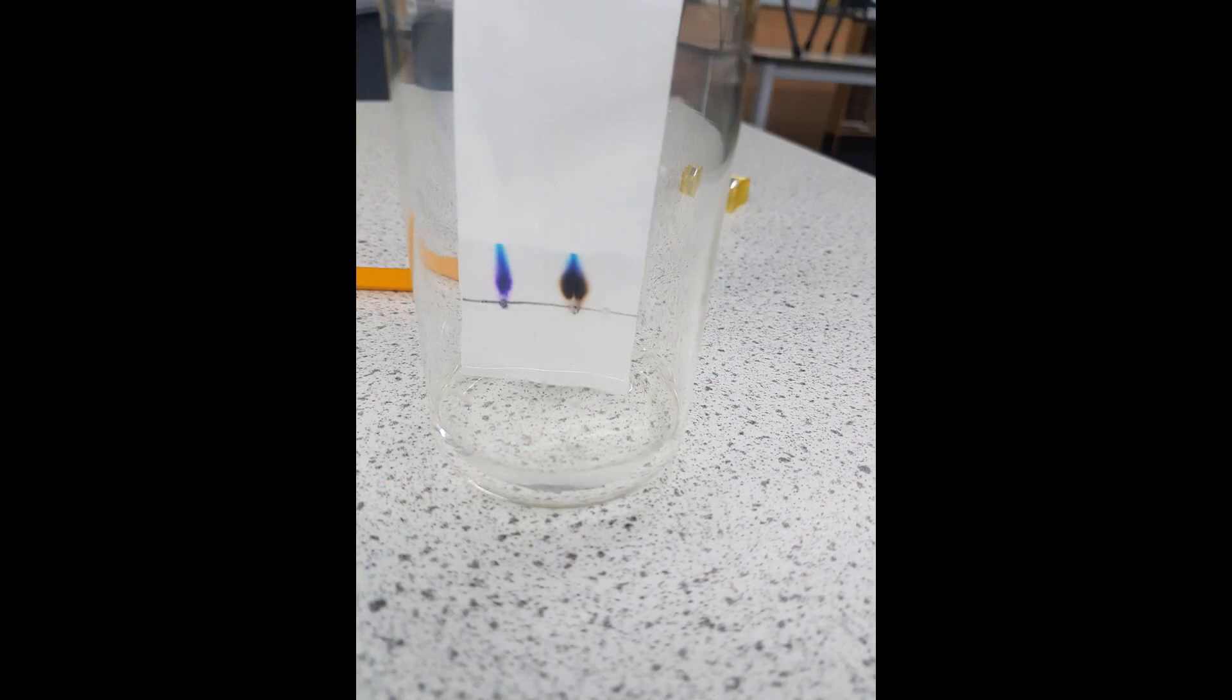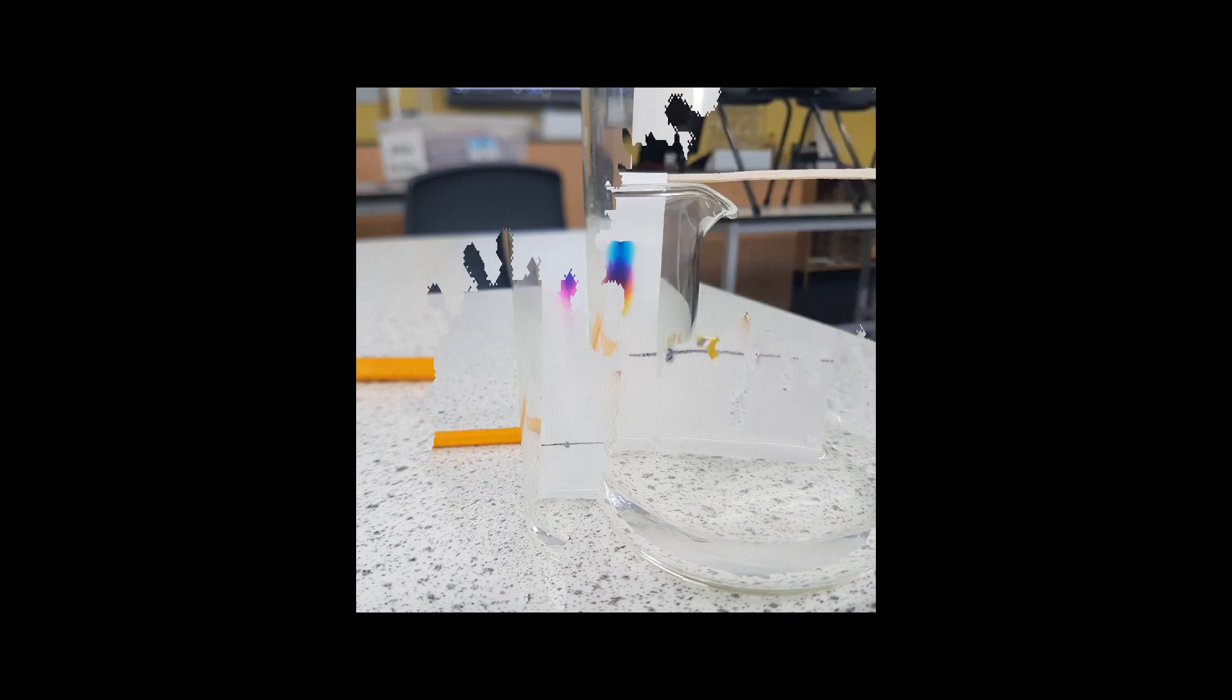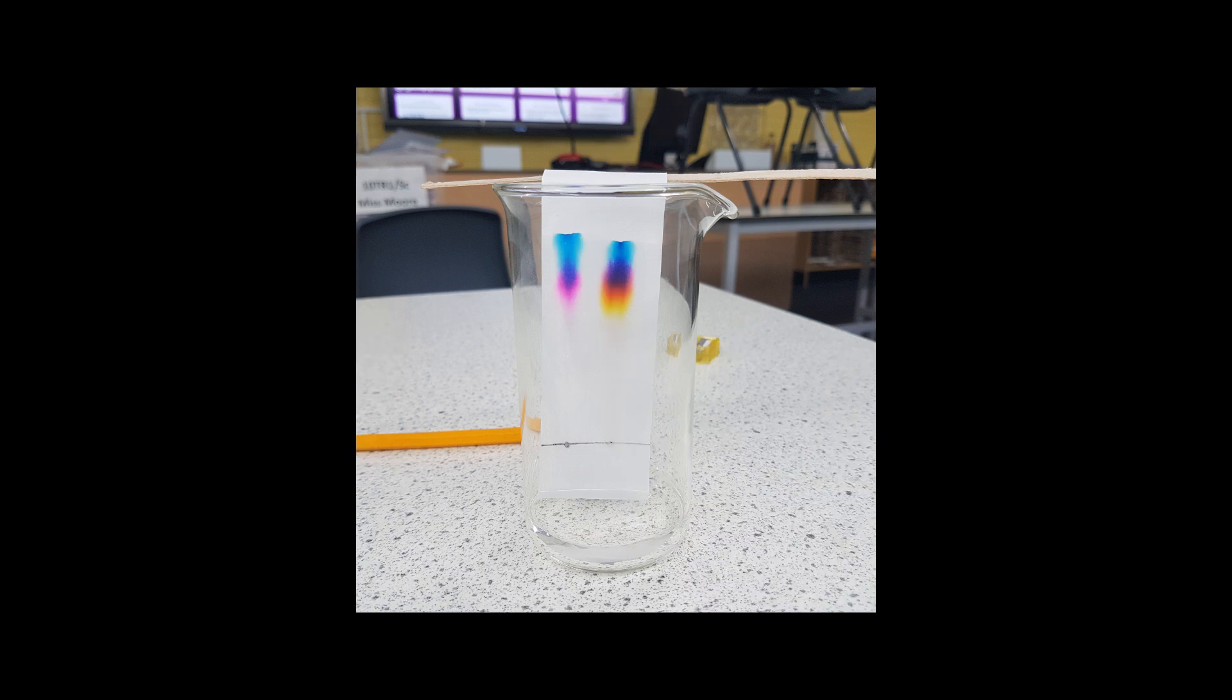And so what you'll start to notice is over time the colors within the felt tip pens will start to separate, and they form some really beautiful and amazing colors. And it shows you what this color that you had originally, what colors it was made up of. So then what you could do is you can work out what's called the RF value. You've got to give this experiment quite a bit of time.